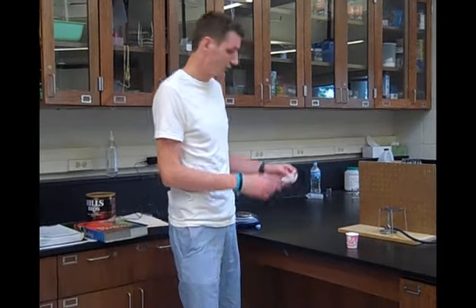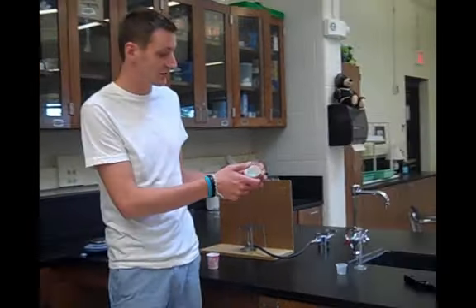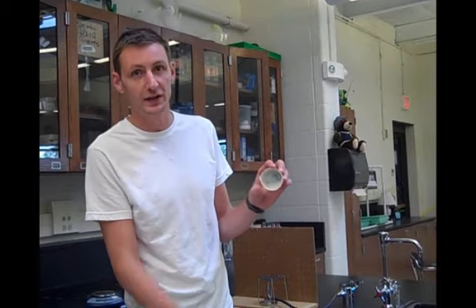Make sure you clean all this. This can go in the sink, and you can scrape the solid clean and put everything away where it belongs.